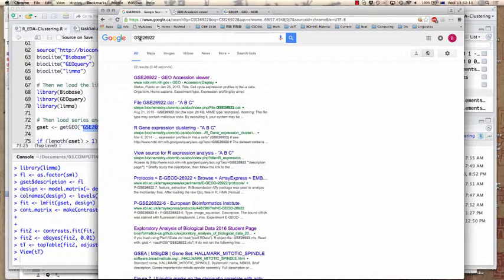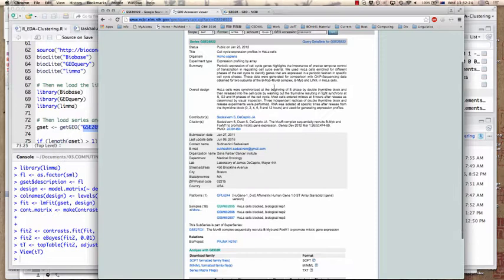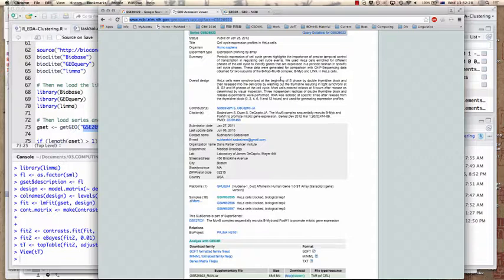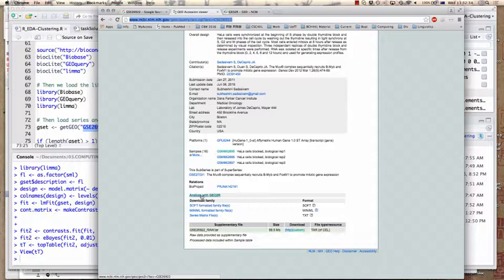If we simply Google for the string GSE 26922, we get the GEO accession viewer, which has information on the dataset — what it contains, periodic expression of cell cycle genes, and so on. There's a link called 'Analyze with Geo2R', and I'd like to briefly introduce this tool to you.